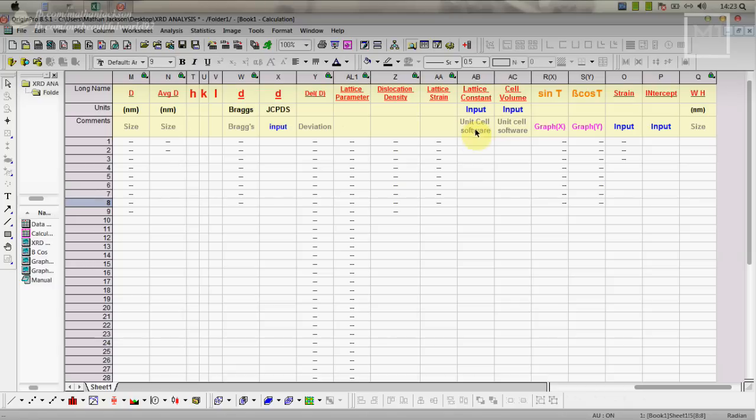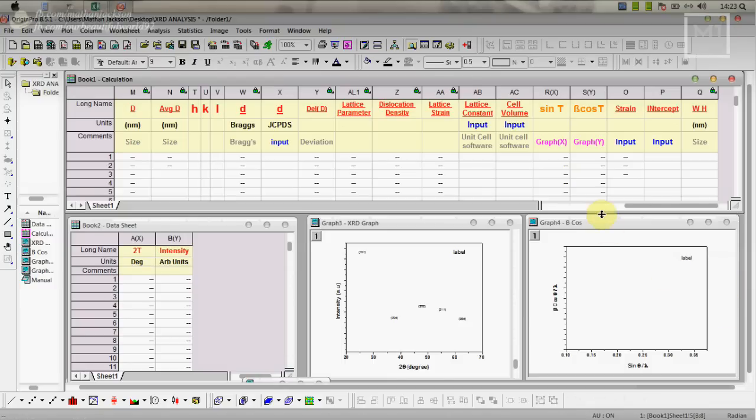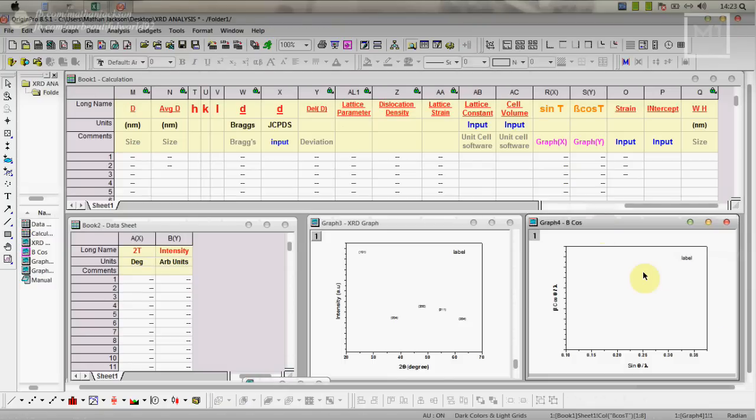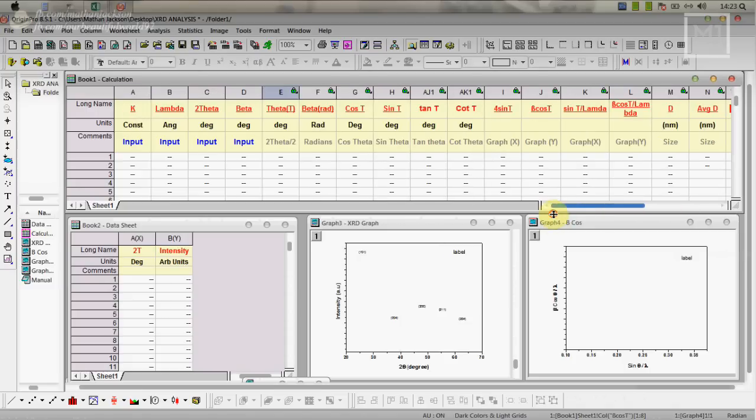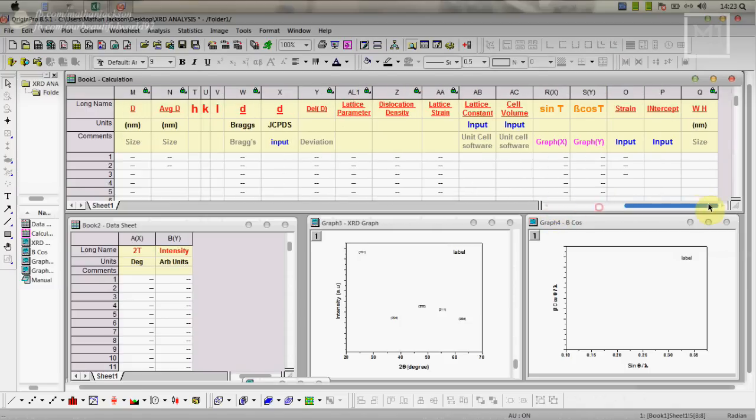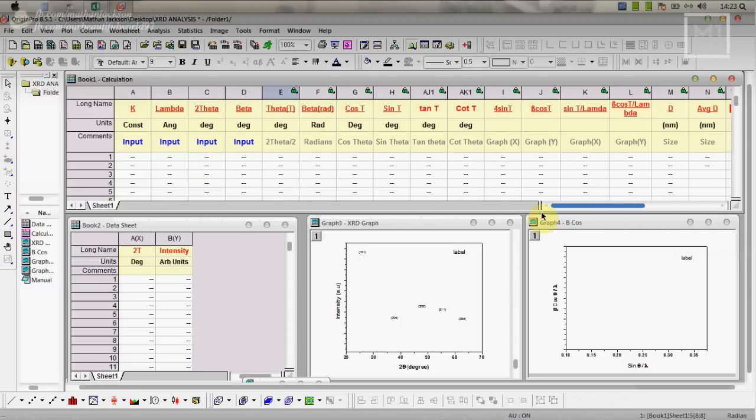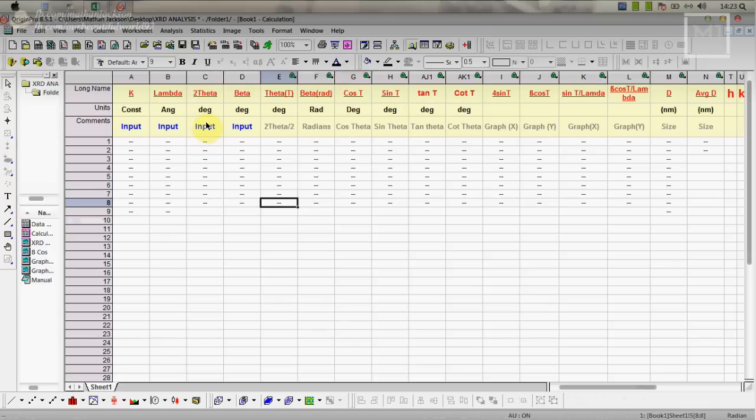This is the lattice constant input and cell volume input. For that we have to use unit cell software, we'll discuss that later. Strain and intercept we have to obtain from this graph which is the WH plot. From this we have to do linear fit. From that we have to calculate the slope value and intercept value. If we put that we will get WH particle size.